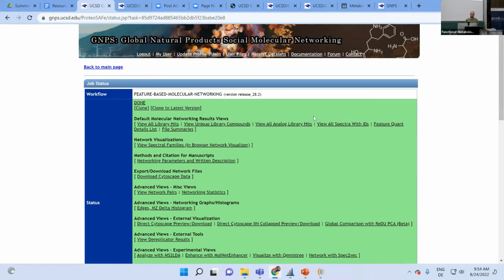So it's very hard, and you can have false positives with 0.99. So it is really best to look at the matching spectra. I mean, obviously, the more hits you have, it's not feasible anymore. So there are a couple of ways to estimate FDR. With the Dorrestein lab, we tested a tool that they developed called PASSATUTTO that helps you estimate FDR, but it's not super straightforward at the moment. So we're not where proteomics is.